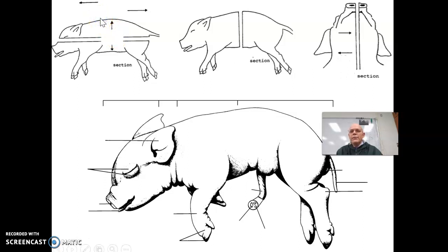All right, let's label some of those first. All right, first of all, anterior. On us, that's the front side of our surface. Well, on a pig, since they're pointing forward like this, that is this side of the surface. All right, this is the anterior. And then obviously toward the other end is going to be the posterior. All right, that's why we think of posterior as the rear. Okay, it's our back side, but for the pig it's this back half. So if it's toward the rear, it is posterior.